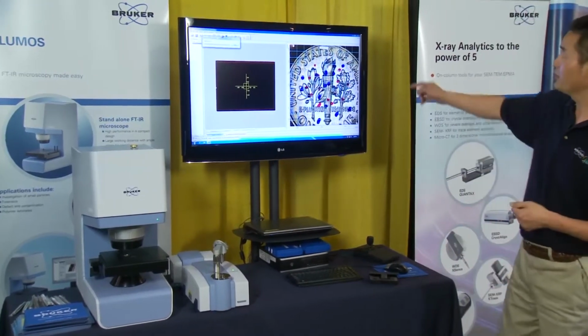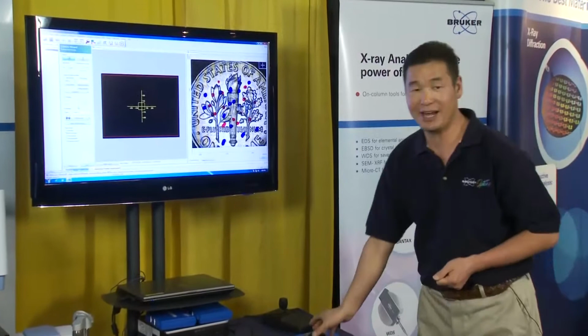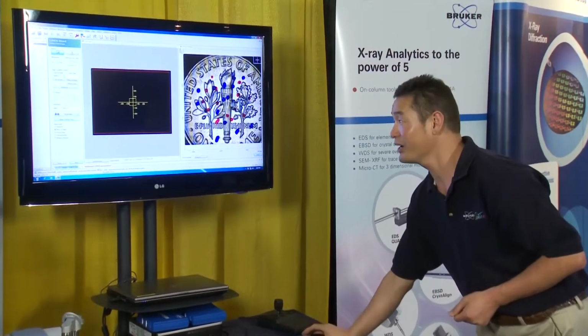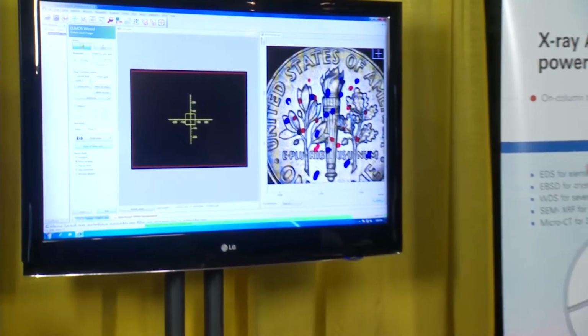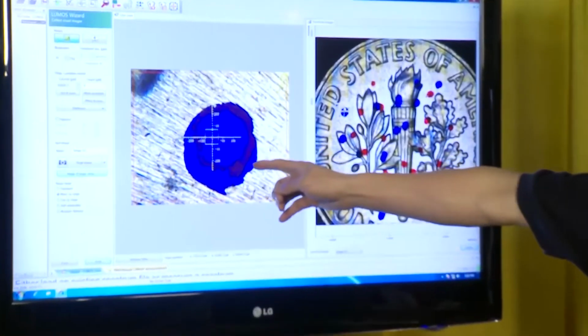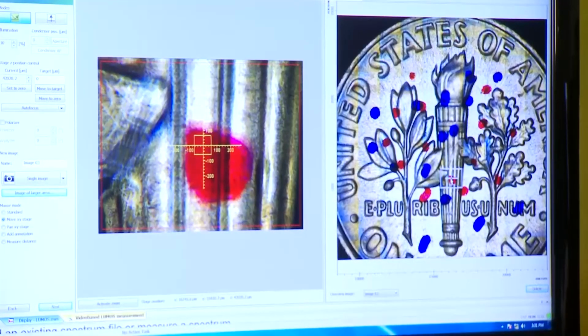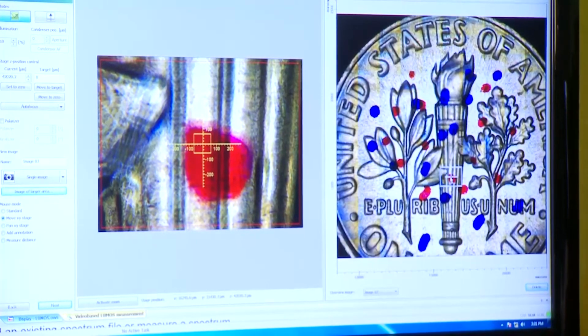Okay, so the sample image has been acquired. Now you noticed I have some special material over there. You can inspect individual material by just clicking it, and it will go there directly. You can inspect individual items and go into an individual spot to check what it is. Of course, this is the visible image.